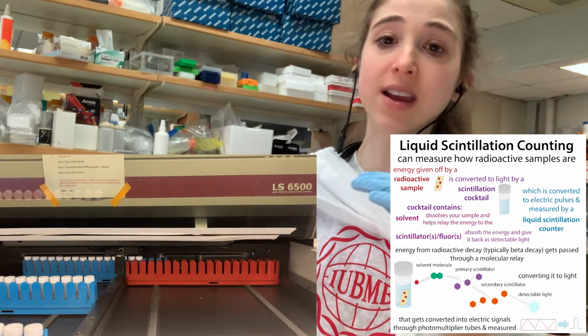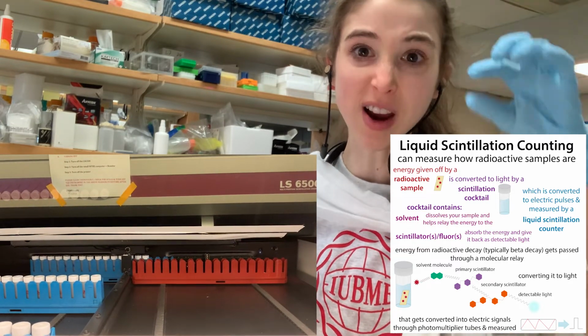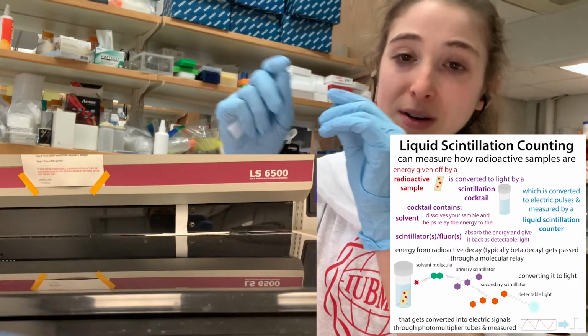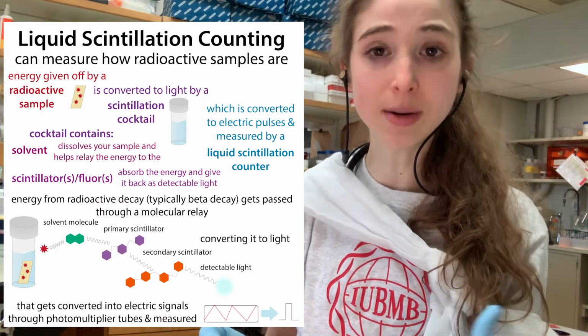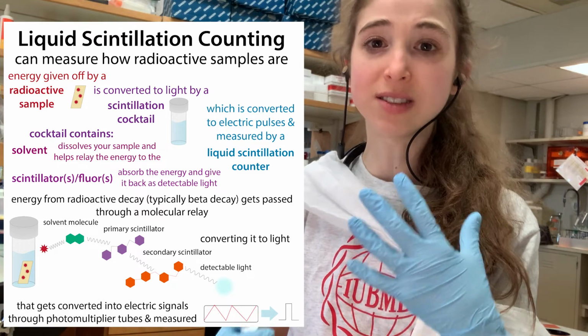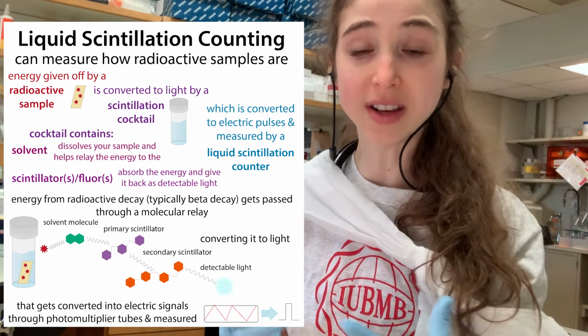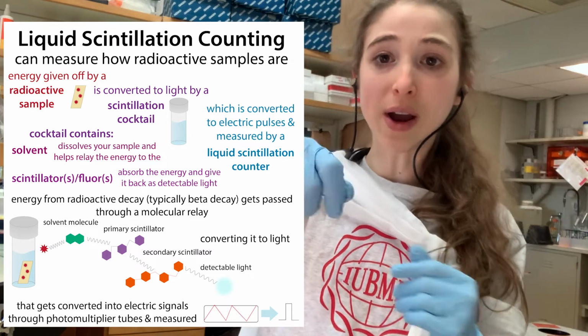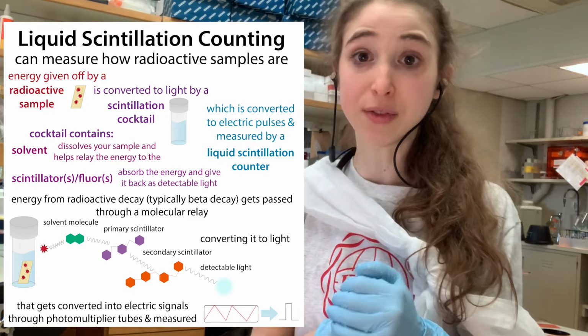like studying how molecules are made by tracking the radio labeled isotopes. We'll get into this and where they go, as well as studying drug metabolism, and so how drugs are taken in and broken down by the body, as well as things like taking wipes from surfaces and testing to see if they're radioactive.